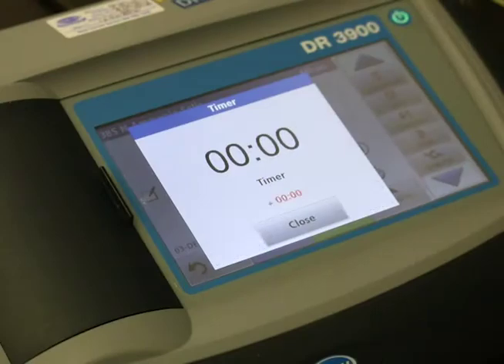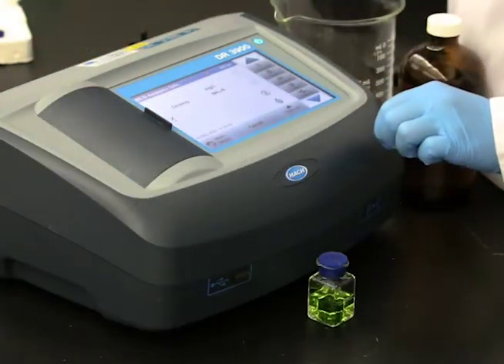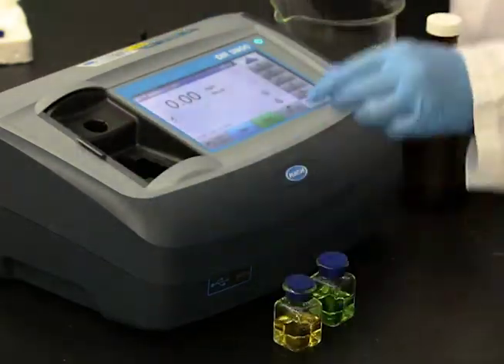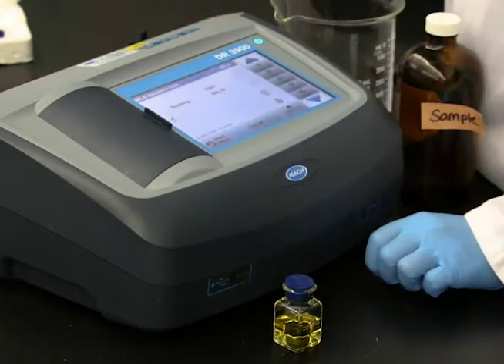When the timer expires, clean the cells and insert the blank into the instrument. Zero the instrument. Remove the blank cell and insert the sample cell. Read and record the results.